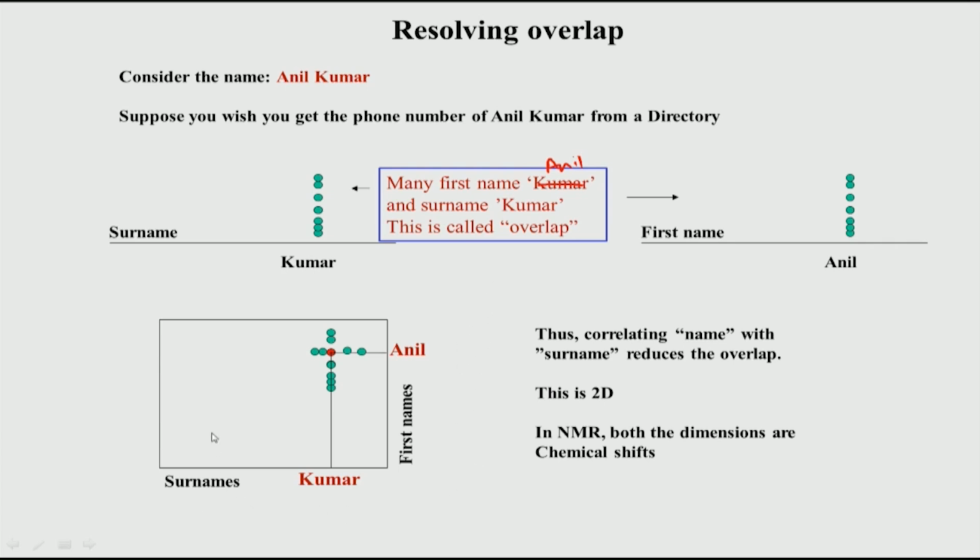So, you see by combining the carbon and proton chemical shifts, I was able to get a unique combination and I was able to resolve the overlap problem. If you remember, in the case of 3 protons and 4 carbons, we had 12 possible combinations, but instead of 12 combinations, I reduced the problem to only 3 combinations.